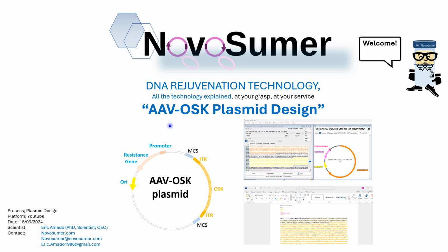In this session, the ninth one, we're going to see the adeno-associated virus plasmid design that you have here. We're going to see how to design this kind of plasmids that carry information for amplifying adeno-associated virus plasmids in E. coli, in bacteria. You see here, this plasmid consists of two parts.